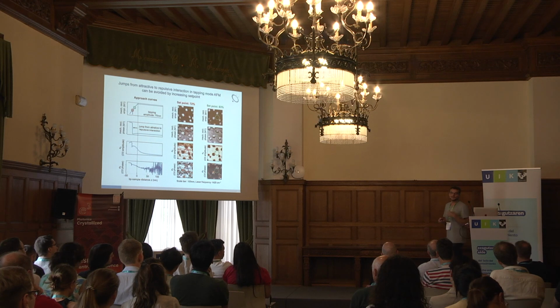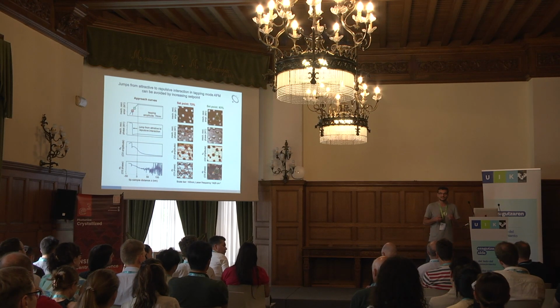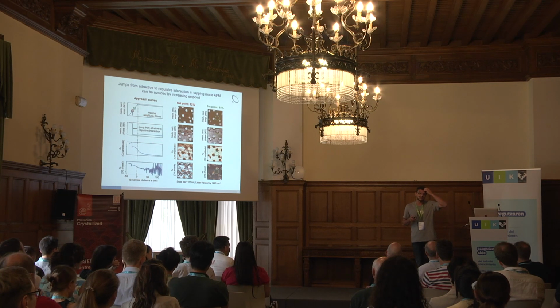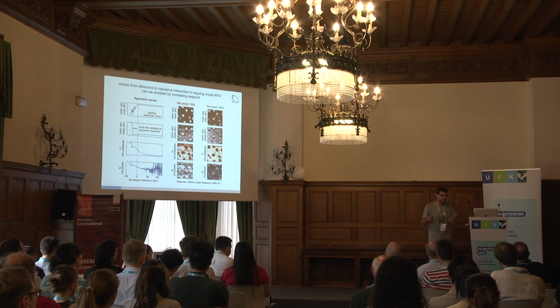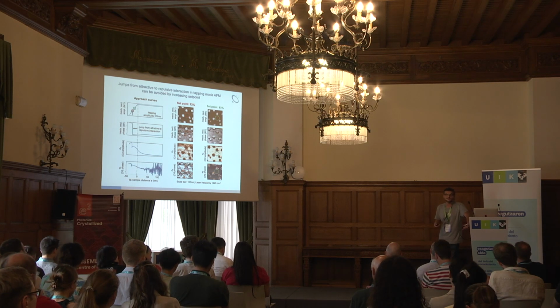Yes, I'm actually pushing for that since always, that we have more flexibility to change parameters while scanning. The aspect is very restrictive here because, of course, you can make a lot of nonsense. If you change the wrong parameters during scanning, you crash the tip and then you start from scratch, or you start doing even worse stuff. But for a little bit experienced user, it's really helpful. Like in the old version of the microscope, one could control things in parallel.